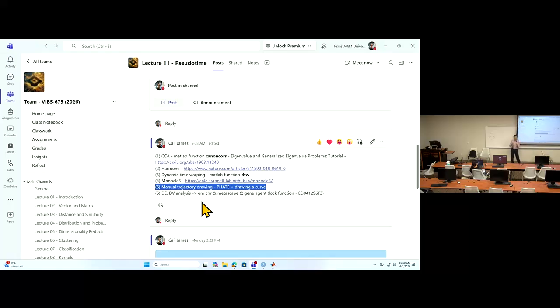But because this is a very heavy-duty computational platform, I don't want everybody to send jobs, it will crash the server. So I gave you a password, and only with this password can you use this function through the interface. Otherwise, there's no way for random people to use it. Okay, I'll show you how to do this later on.